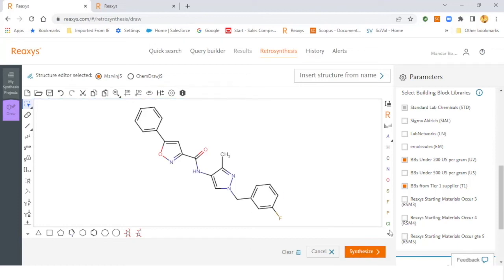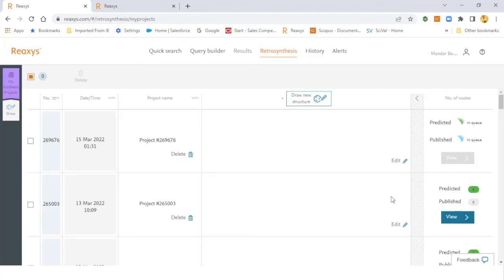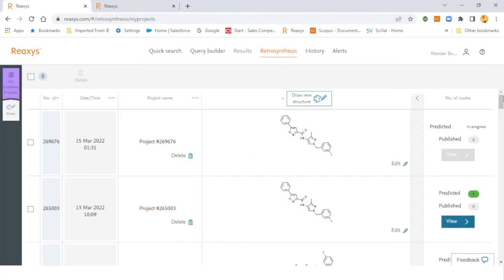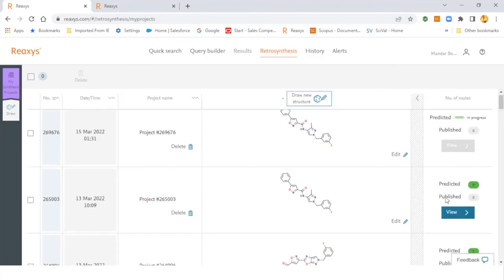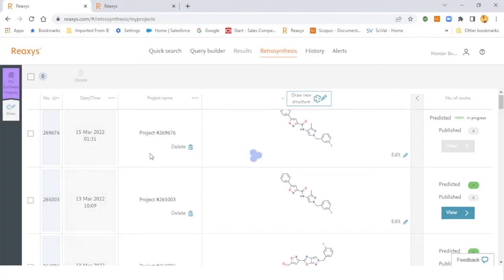Once you hit the synthesize button, the tool will run through the retrosynthesis process. Once the retrosynthesis process is done, you will be able to see those routes in front of you like the one which you can see here directly. You can edit the name of the project as per your need and name them based on your requirement.